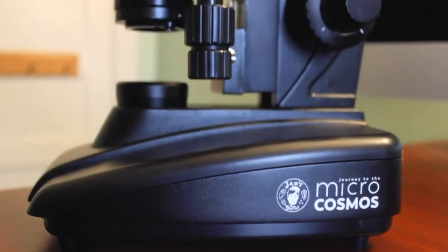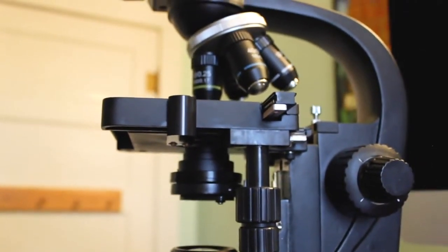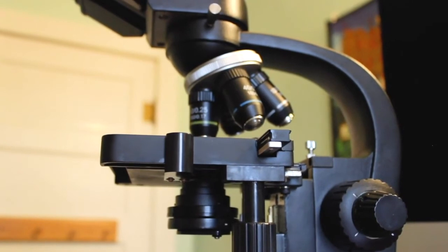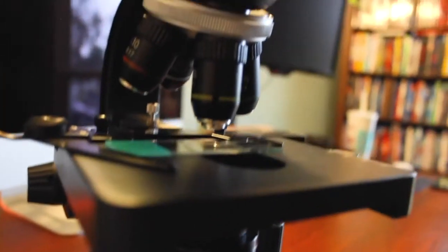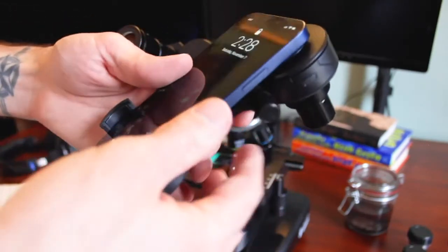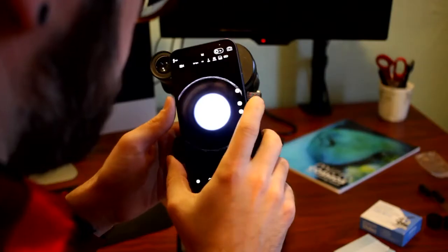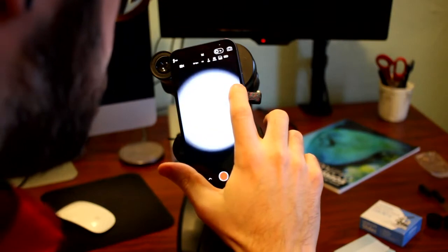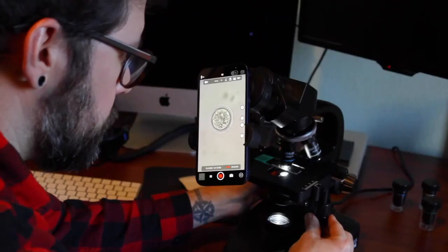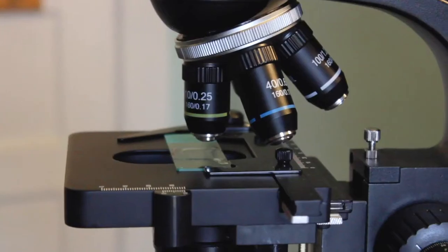We, in partnership with our Master of Microscopes, James, have developed a microscope designed for content creation. Instead of just staring with your eyes, take advantage of the marvelous cameras that we all have on our cell phones, both to view the microcosmos and to record it, so you can share your discoveries with the rest of the world.